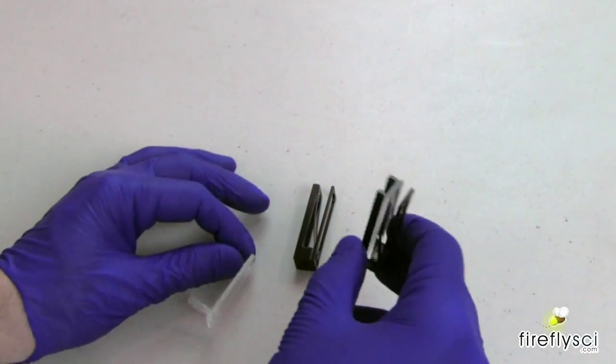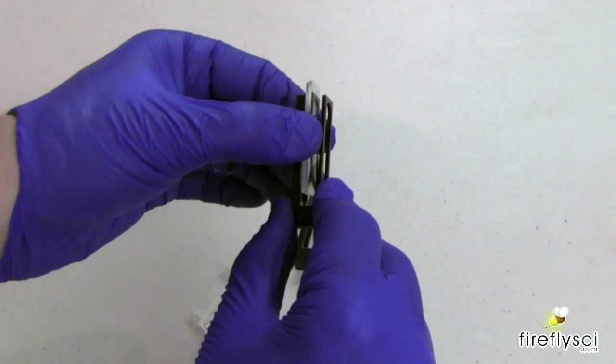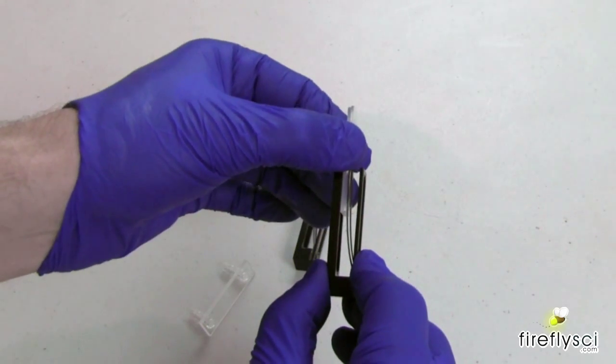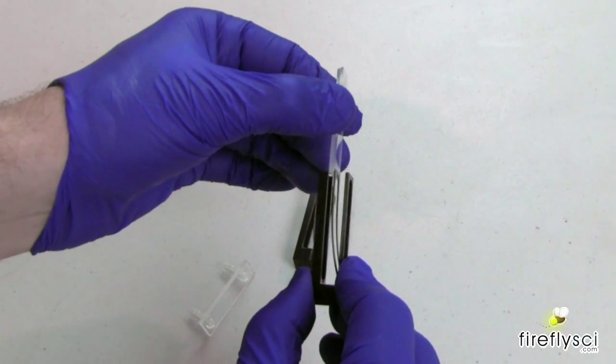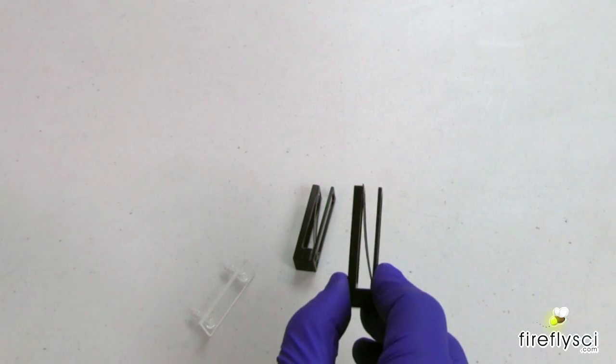Okay, so we're going to take out the Type 20 cuvette, which you just simply slide it right out of the holder. And the spring snaps right back into place. Put this aside.